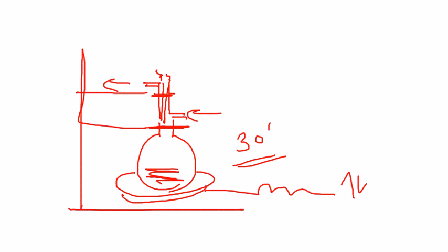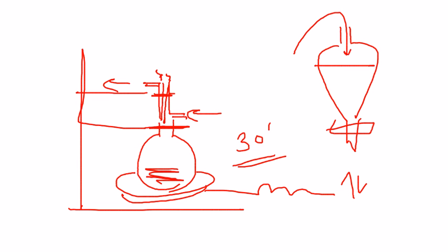Now, as you have completed your 30-minute period, during that time, essentially you will cool the reaction. You will allow the reaction mixture to cool down, and then you will transfer it into a separatory funnel. So that's your separatory funnel. So you pour down your reaction into that separatory funnel, and you're expected to see 2 layers, one for the non-polar product, and second for the polar reactant, which is aqueous acid, essentially. Since it's greater in density, that's going to be the lower layer.